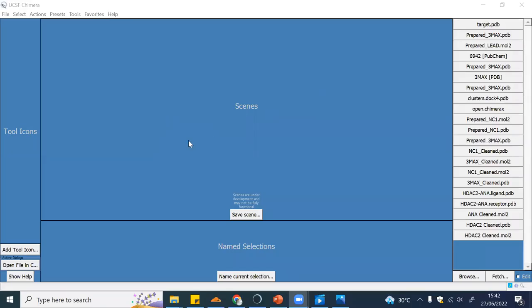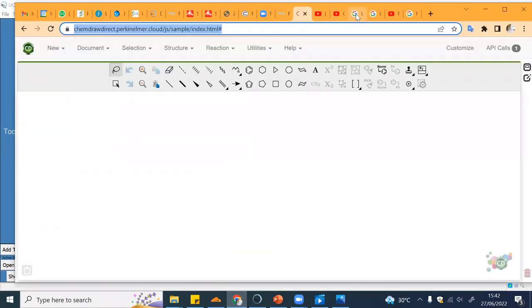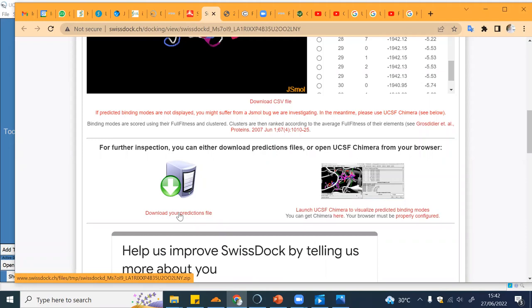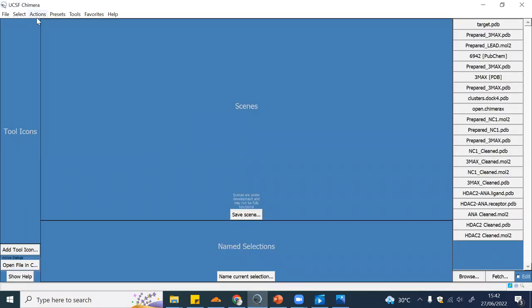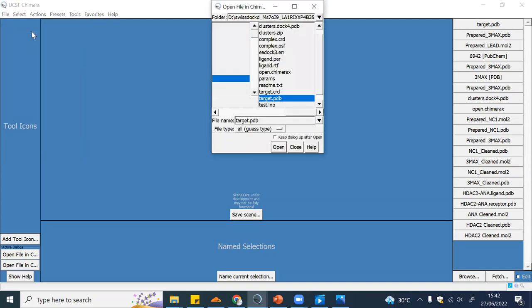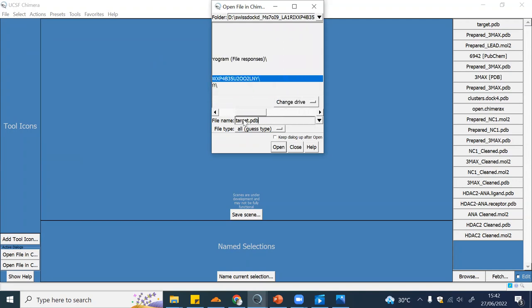Now we already downloaded the file. After you download, make sure that you unzip the file and know the directory or folder that you save this file in, because later on we will need to open it through Chimera.